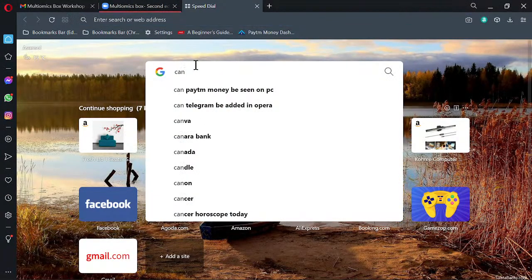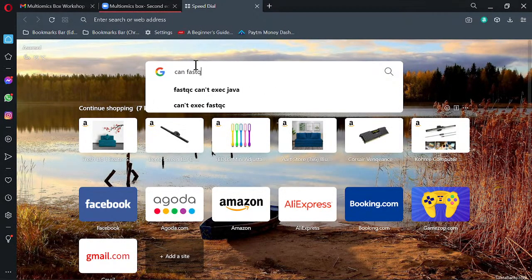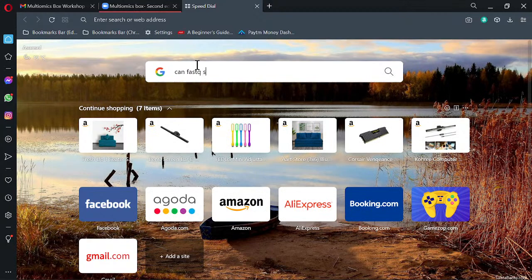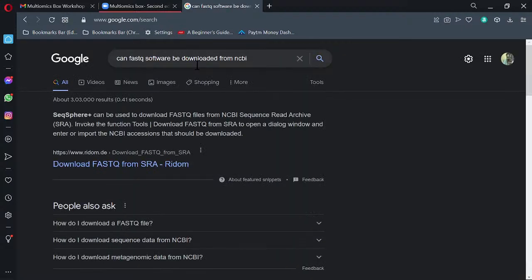Repeatedly. Suppose we have completed the one part, one replicate, then we'll go for the second replicate, then the third replicate, fourth replicate, and fourth sample, fifth sample, sixth sample. You have to do it individually in the same way for stress tissues. Because I can't cover everything in an hour, I just take one example, selecting one file to show you how it works.